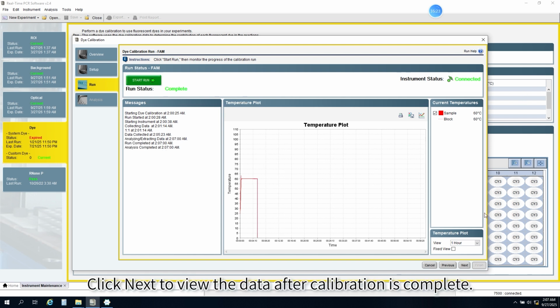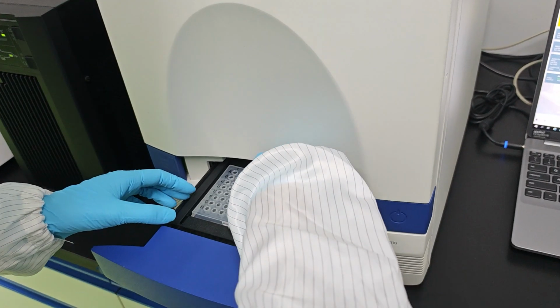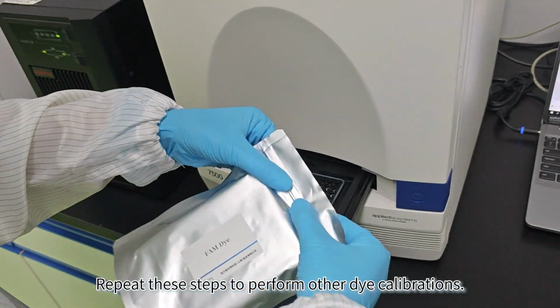Click Next to view the data after calibration is complete. If Passed is displayed, the calibration has passed. Then click Next. Follow the software instructions to remove the dye calibration plate, return it to its packaging, and store it in the refrigerator. Repeat these steps to perform other dye calibrations.